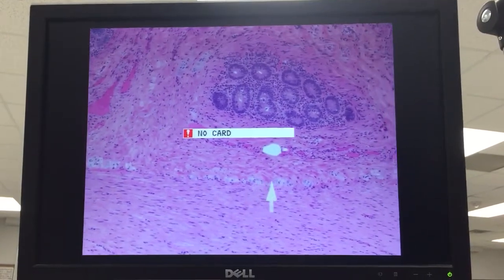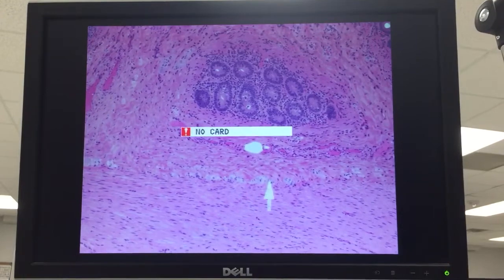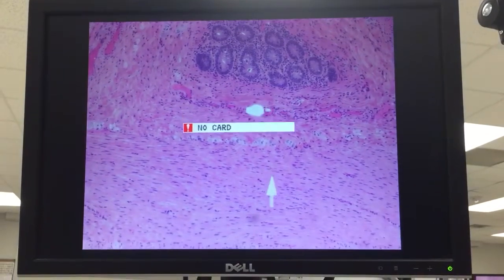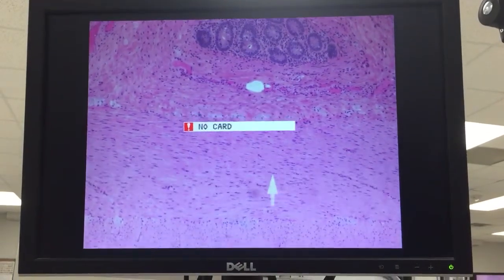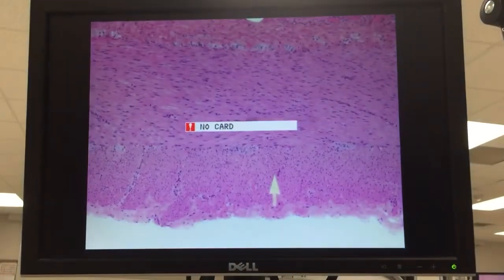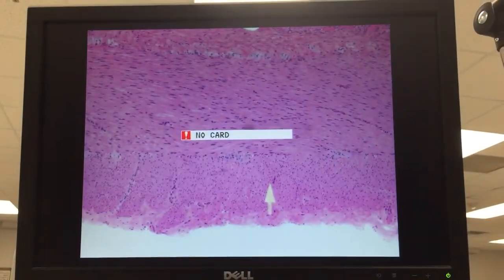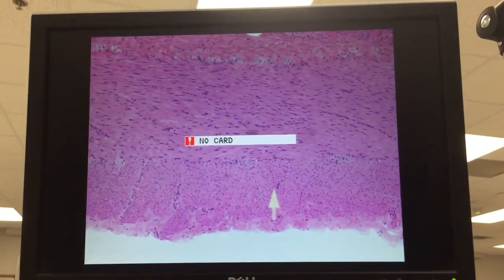Meissner's plexus. We have several neurons. Inner circular layer.